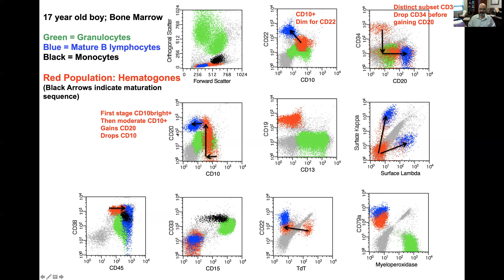In terms of CD10 versus CD20, they start off with a little blush of brighter CD10 cells — also seen in the CD22 versus CD10 plot. They start a little brighter for CD10, then become moderate-positive for CD10. Sometimes people use this to define stage one, stage two, stage three hematogones. Then they start gaining CD20, gaining almost a full spectrum of CD20 expression. This is a perfect hematogone smear on CD10 versus CD20. Eventually they drop CD10 and become mature B lymphocytes.